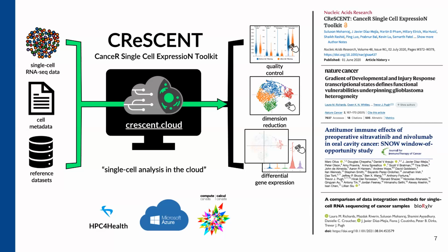So there literally is a reason and a way that we're handling all of these. And I'll talk about that more, about what tools we're using, how we're able to package up all these tools into essentially buttons. And once you get your interactive analyses, you can start to explore your data, and all of this happens inside of the web app. So this work was published in 2020 in Nucleic Acids Research.